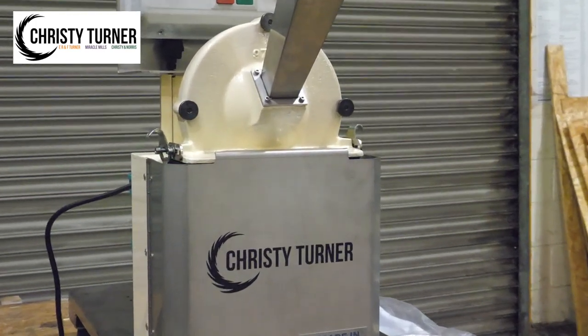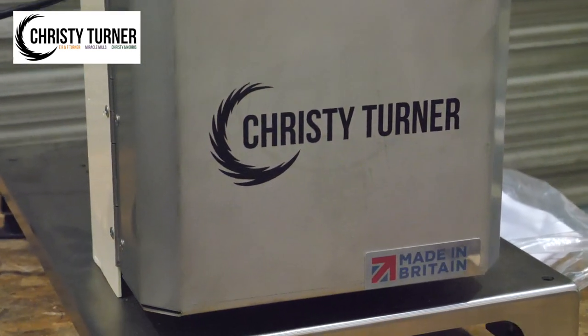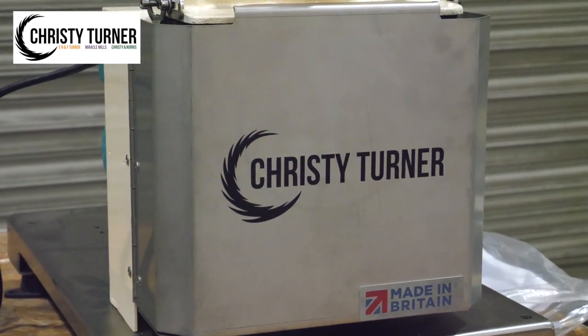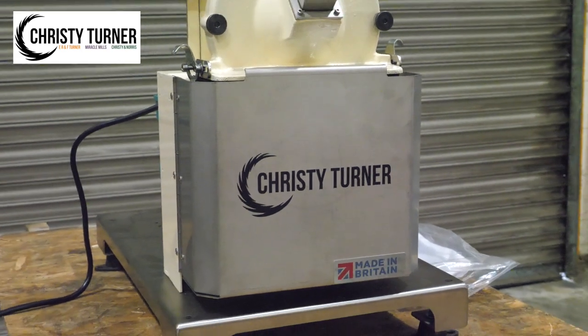Our small-scale lab mill has been developed for laboratories, universities and multiple small batch grinding applications, including agriculture and environmental use. Shipping worldwide, the lab mill provides a reliable and robust choice for small-scale grinding and sample purposes.